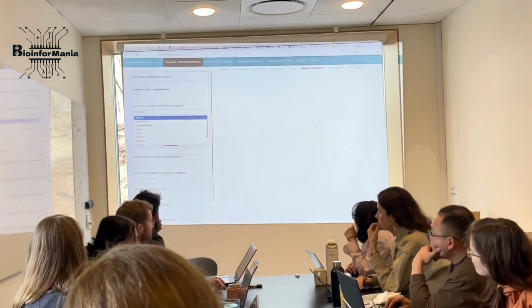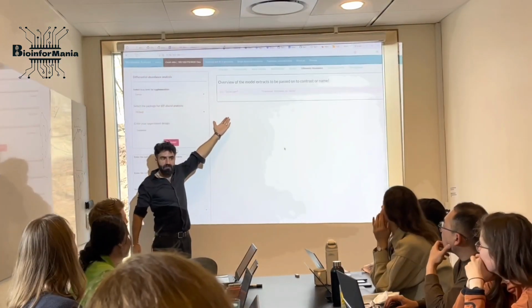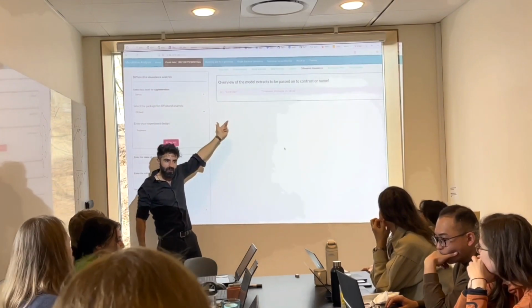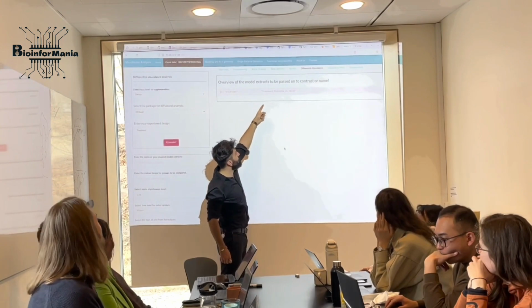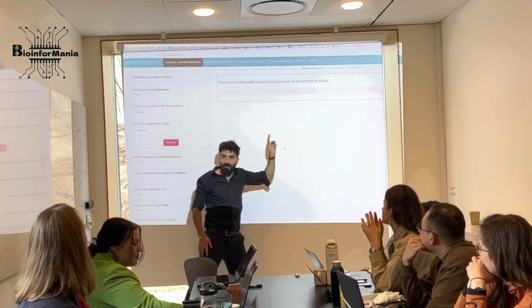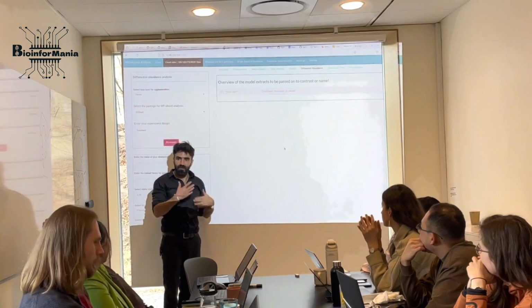Here you have different modelers. You have DESeq2 and ANCOM-BC. An intercept, when the levels of these are 0, you have nothing, you still have something. And then here it gives you the estimate for treatment group, protozoa versus naive. So the order of this is important for us to be able to read the following plots.